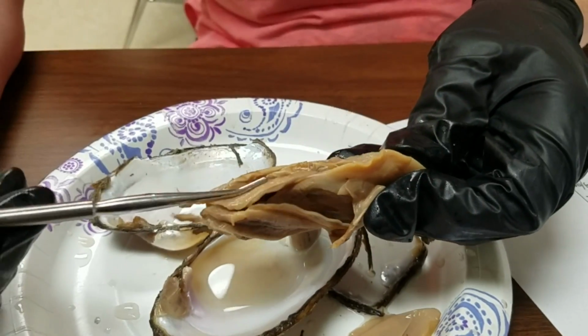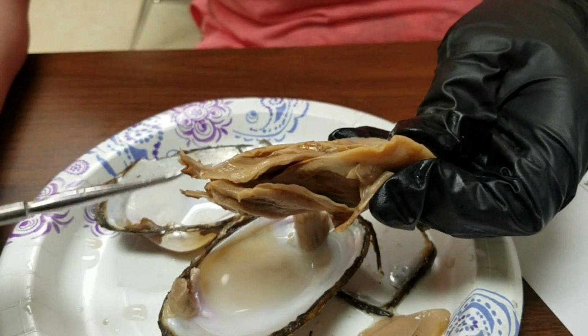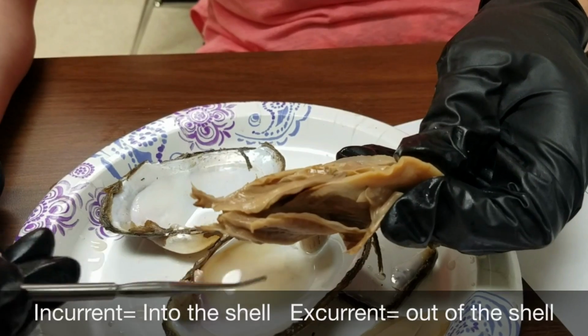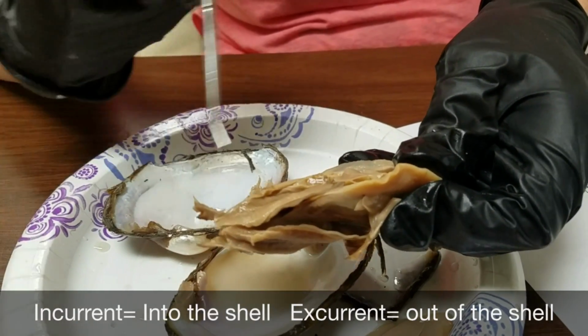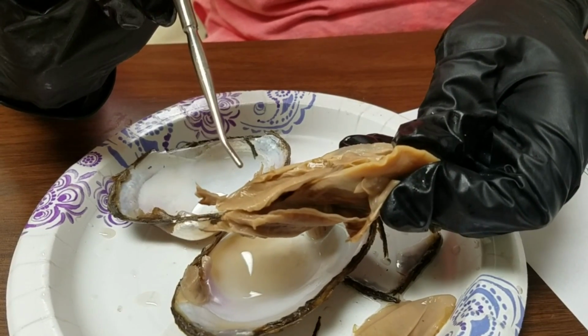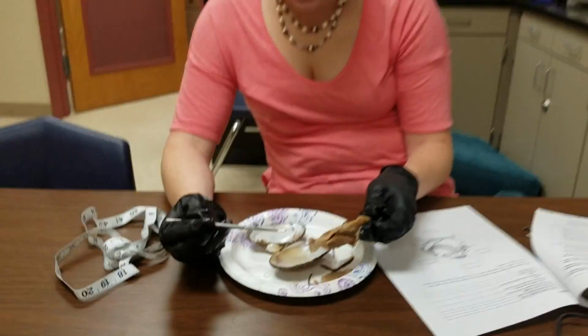So yes, if you find siphons, cool. They look like two little tubes, and they use them to get water. The in-current siphon is going to suck water into the clamshell, and the ex-current siphon is going to force water out of the clamshell. And I think that's it.